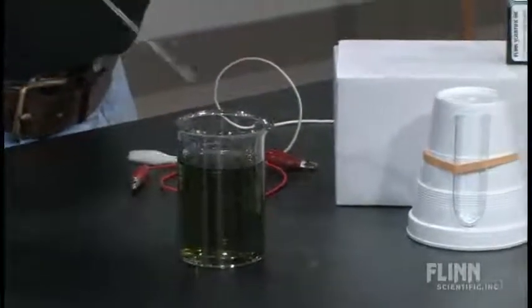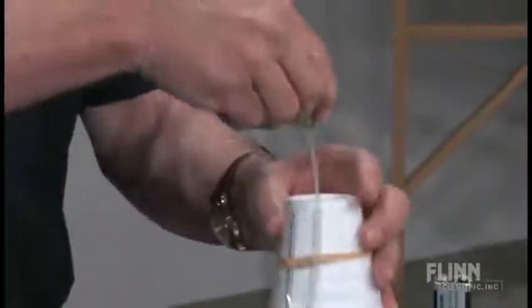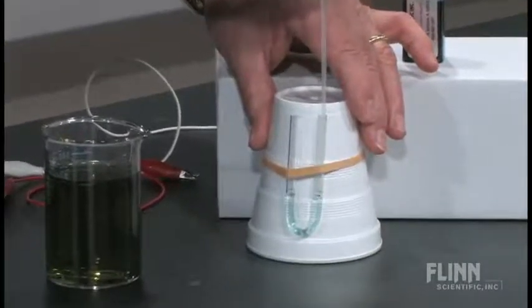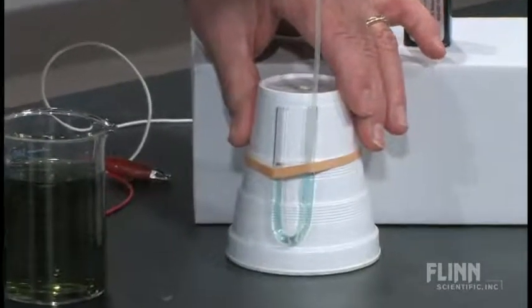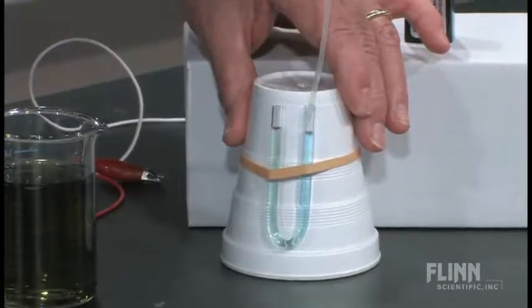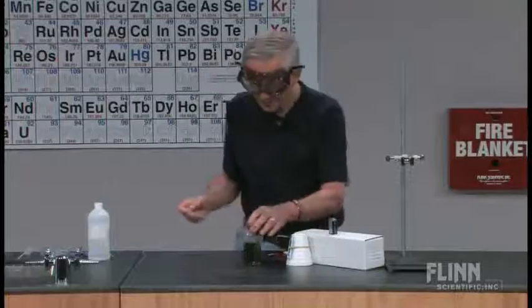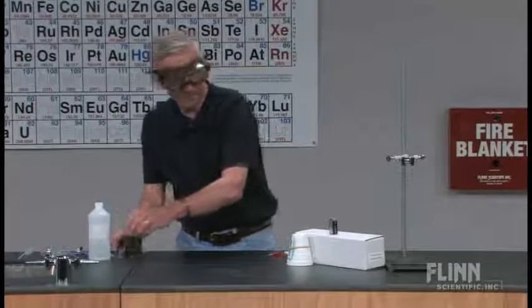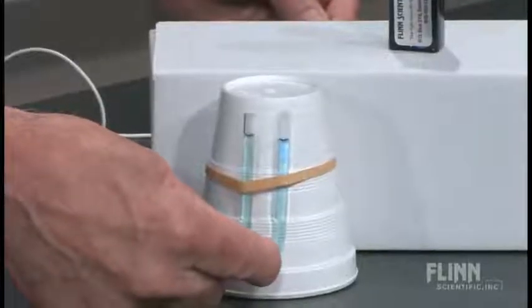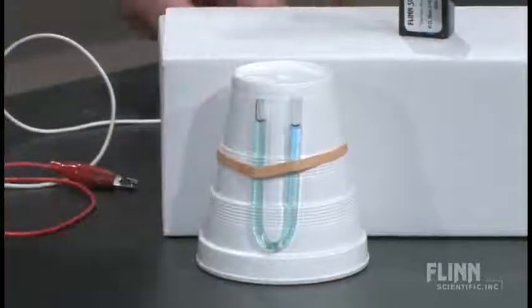So what I'm going to do is use a pipette to put the solution down in there. When you're filling these, this is a tip I give my students. If you notice, I started with the pipette down low, and I squeezed fairly slowly. That's a way to keep from getting air bubbles in there.